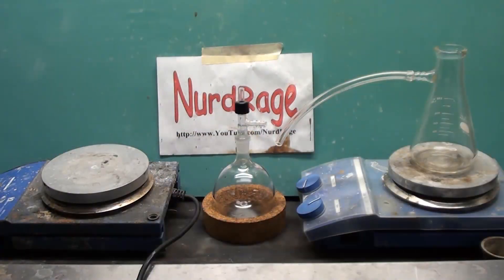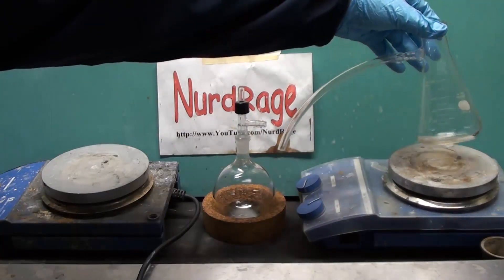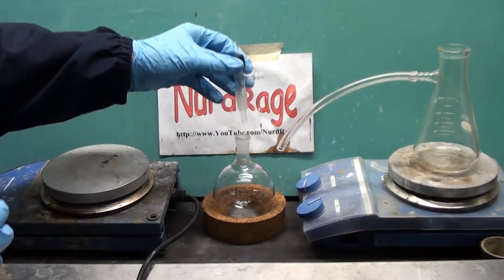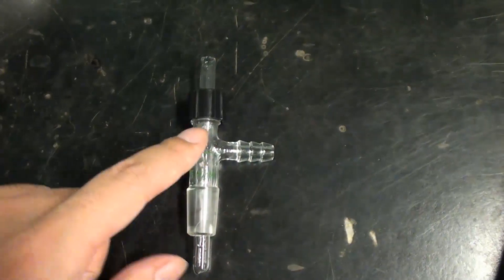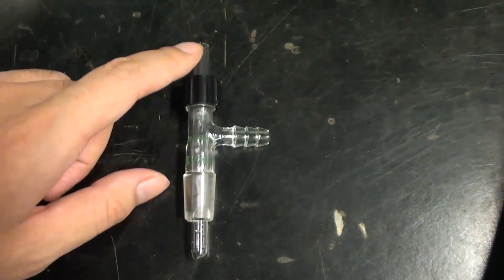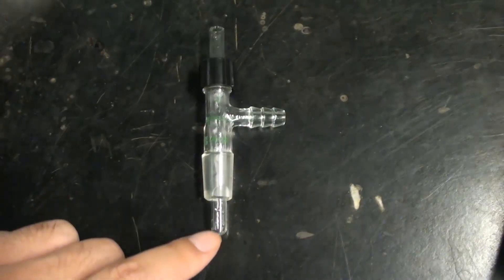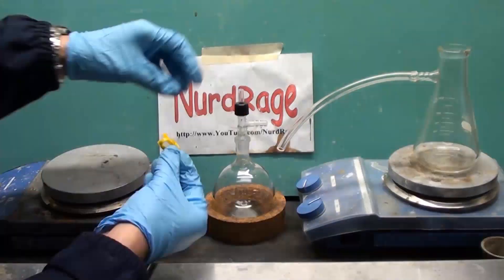First we need to set up our apparatus. This vacuum flask will serve as our hydrogen chloride gas generator. In the middle I have a round bottom flask that will catch any liquid that backflows. Gas can flow around the outer tube into the round bottom flask, then back out the inner tube. If any backflow occurs the liquid will go into the round bottom flask but will be unable to go into the generator. Let me attach that together.